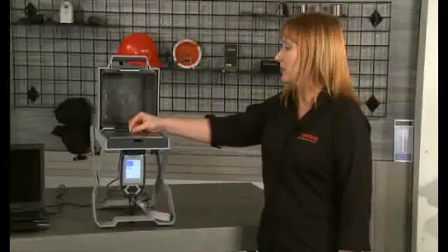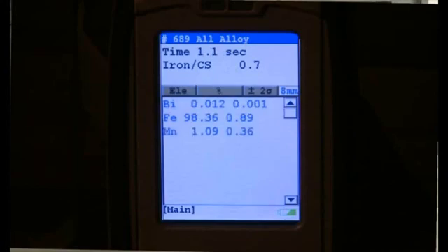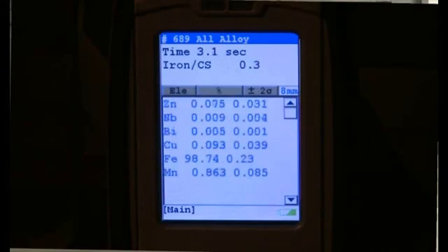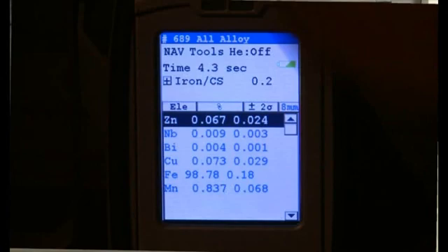This is a material that has a zinc coating. Notice if I measure at the end of the screw where I have ground the surface, the reading for zinc drops dramatically. Since some of the signal is still received from the non-ground areas of the bolt, we still note some small zinc reading. The alert operator will know that the steel alloys don't contain zinc. Therefore, the conclusion is that it must be coated and we should grind the sample prior to its analysis.